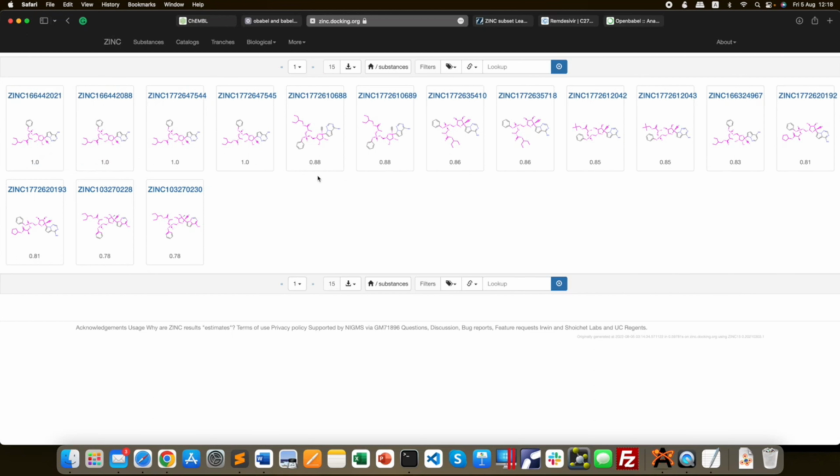It depends on your interest what molecules you require, and if you need a bigger database, there is another link which I can show you over here. You can download 1 million and 1 billion compounds from the ZINC database and utilize them for docking. For now, if you are searching for remdesivir with 40% similarity, then go to this option, download.